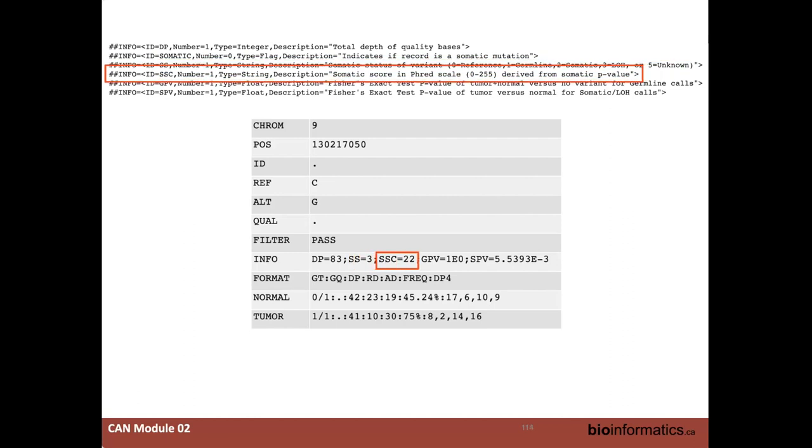The next portion here is some kind of quality score for this particular variant. And again, we know what the Phred scale is. This is the third iteration of us seeing that Phred scale, but applied to something different, with calculations that are still pretty much the same. Depending on the tool you're using, they'll actually give you some stats. In this particular case, with the alignment for the tumor and the normal, you'll get a p-value associated with that one.